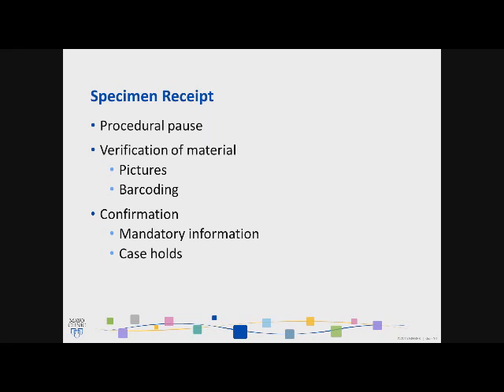Other things that we receive here at Mayo Clinic are consult cases. These are cases that have previously been accessioned, processed, cut, so they're either blocks or slides that have been received and processed in another institution and then sent here to Mayo Clinic for a consult. Those cases are often set aside until they receive all the necessary information.